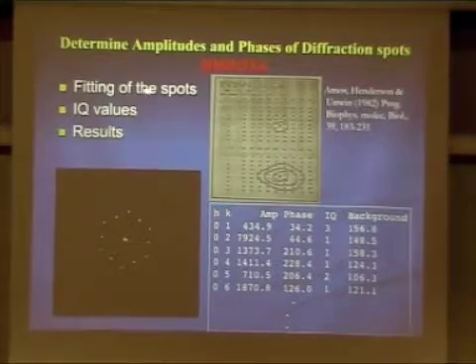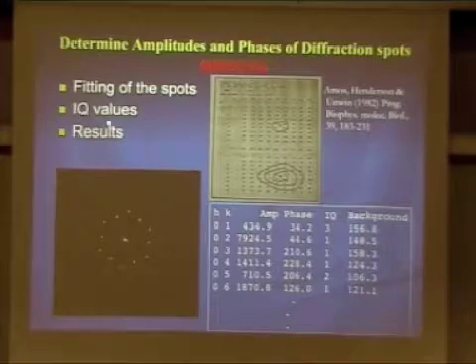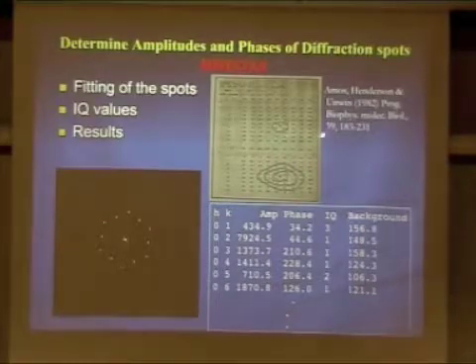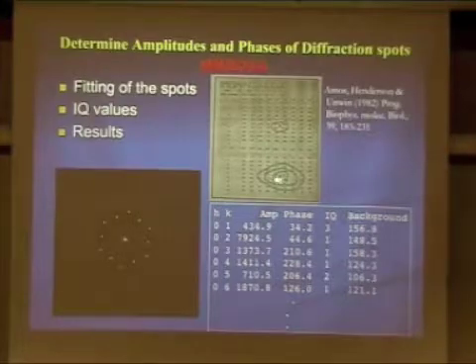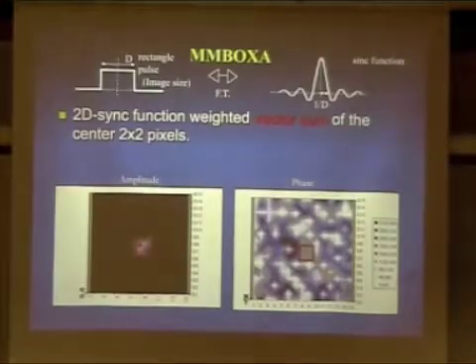I will explain what it means, and then I will show you the result of the way they are doing these two parts. In the early days, what they were doing is actually printing out the intensity and the phases around it, creating the contours and deciding by hand. So with the program, it becomes an easier job from our perspective.